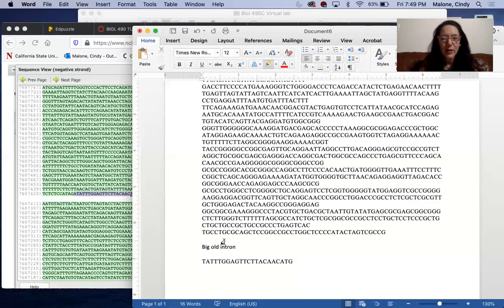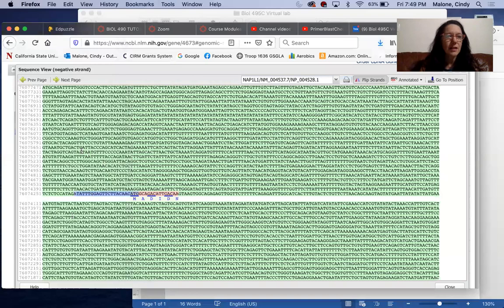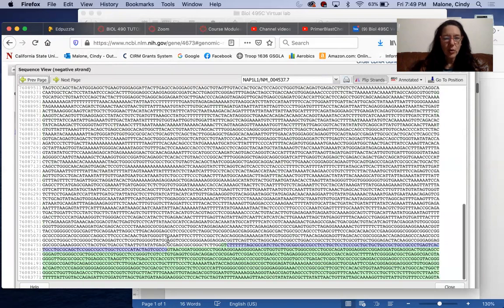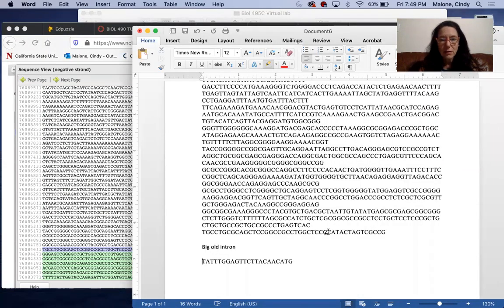Fine. What's going on? So if we go back to this guy, maybe that'll help. We go back to find our 5' UTR. We know that from this G to this string of T's and a C is 5' UTR. So if we wanted to look for that, this G, oh look, there's the string of T's. We could, oh, stop it. All right, this is stupid and it's making me angry. Okay, I'm done. We're not going to annotate where the 5' UTR is. I'm done with that. So this is what you'd save.